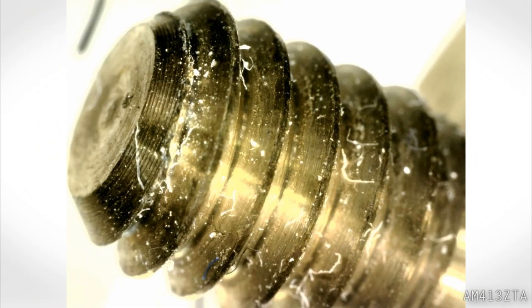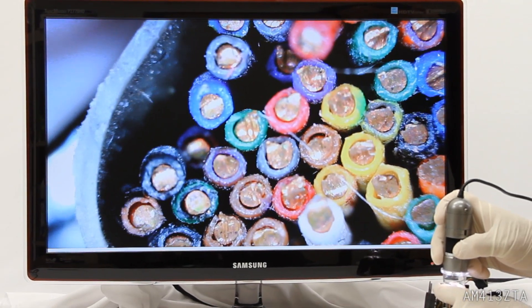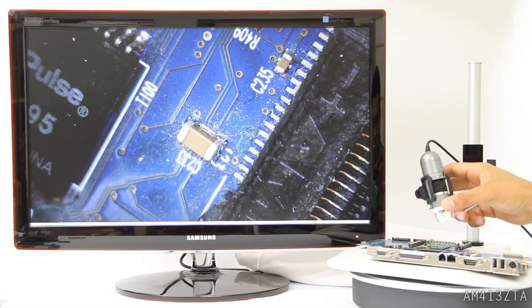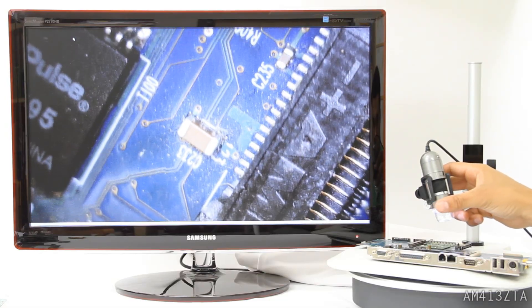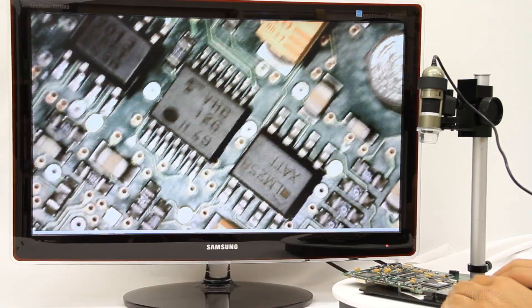The included software also allows you to capture images and video, time-lapse video, draw and annotate images, toggle LEDs on and off, use multiple Dino-Lite cameras, organize photos, adjust exposure and color, save in multiple formats, measure in different units and types, and much, much more.